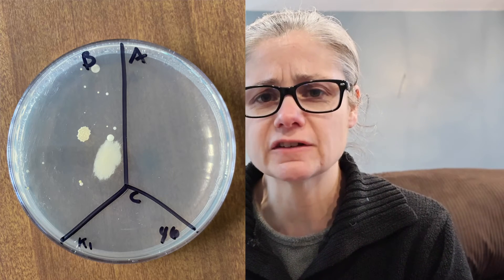Now for some results. Let's look at the first sample: the kitchen floor. In the before section, we can see some bacteria — not a huge amount, but there's definitely some. In the after section, there's no bacteria at all. So the Spic and Span did a great job at removing the bacteria from my kitchen floor, sample one.